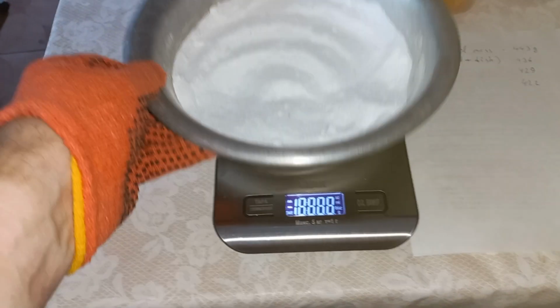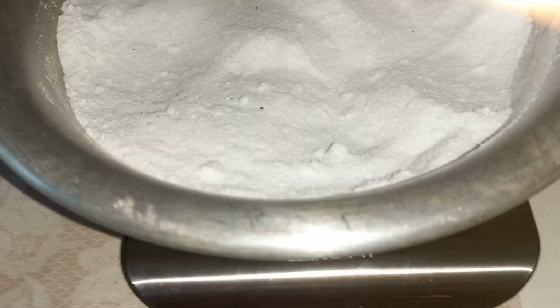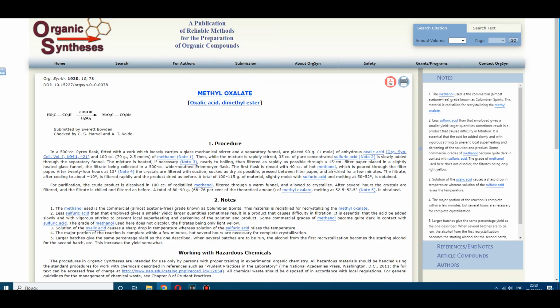I did this in an oven dedicated to chemistry. This took about 2 hours. It's crucial to not heat it longer than necessary, as oxalic acid can partially sublimate under these conditions. Now my oxalic acid is dry, the esterification reaction is straightforward.